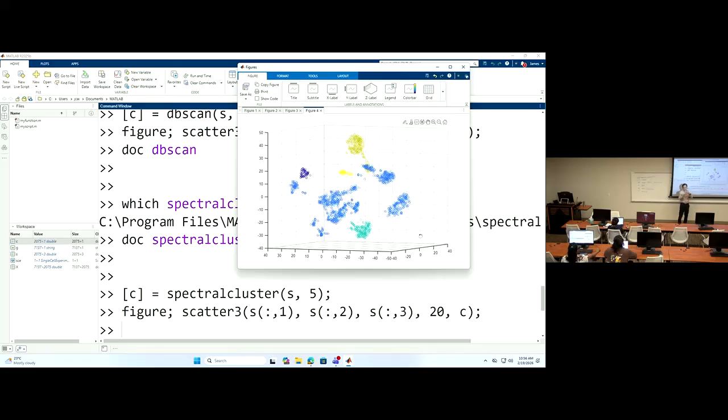Our case is the result of the t-SNE embedding. The t-SNE embedding by itself already tries to group those cells into very obvious clusters. There are no weird shapes like non-convex shapes. So this is not the best use case for spectral clustering. You see the result is not as good as we hoped.